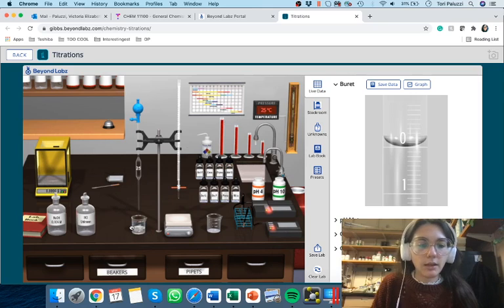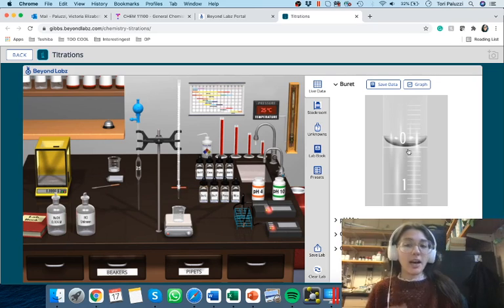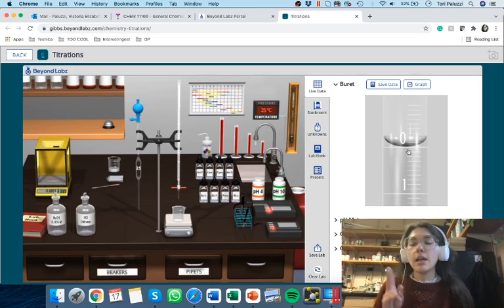Oh, just kidding. It did not. There we go. Took that, and then I tipped it here. We just wait for it to decide that it's okay. There we go. Okay. So now I've got 25.00 mils in here, and I've got 50 milliliters of sodium hydroxide, because remember, we read this thing upside down, which for right now is totally easy. Later, it's totally not, so we'll go through that.